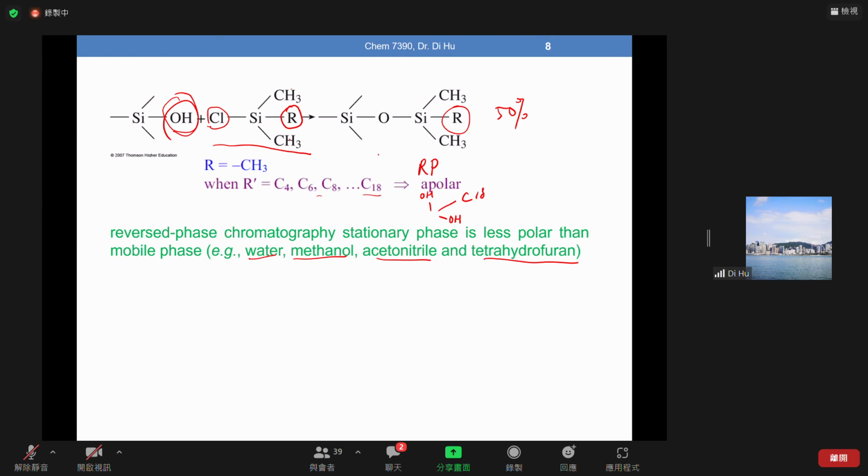After this chemical derivatization to bond the stationary phase functional group onto the silica particle, the siloxane packing material is further treated with chlorotrimethylsilane. So it's further reacted with, this is for information, the trimethyl group. Although the gap between them is a problem, steric hindrance may be an issue for C18 because C18 has 18 carbons.